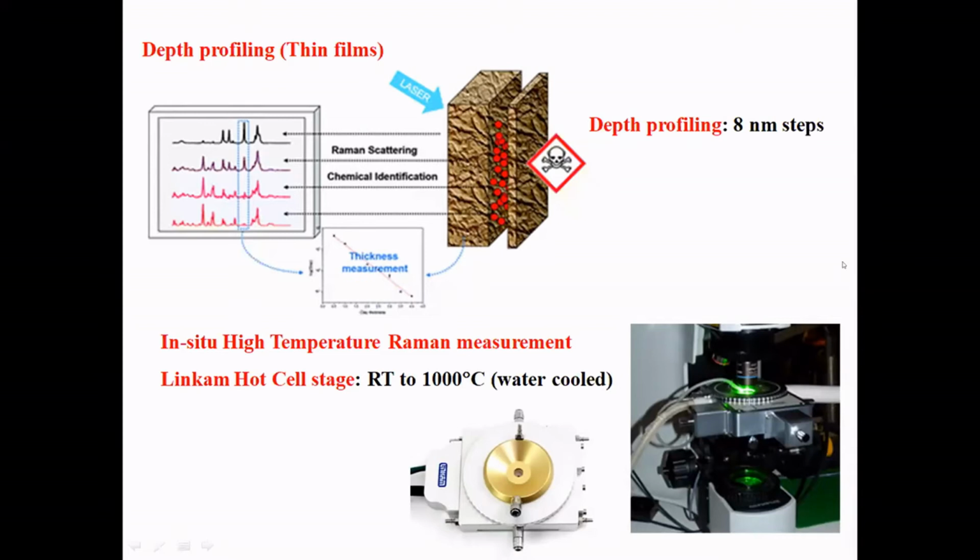And we can also do high temperature measurements, because if you have ceramics or insulator kinds of things, even dielectrics, they are highly influenced by temperature. So how can a person understand if the material undergoes some temperature influences, structural disorders and changes? One can intuitively acquire that information by heating the sample at each temperature.